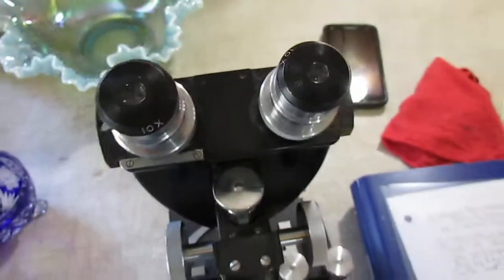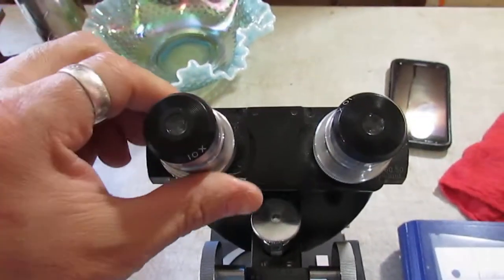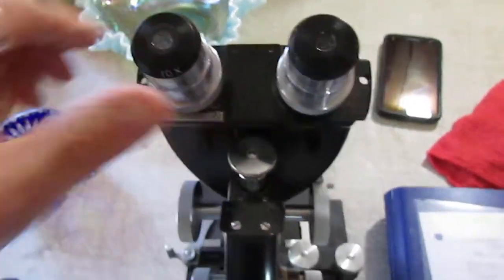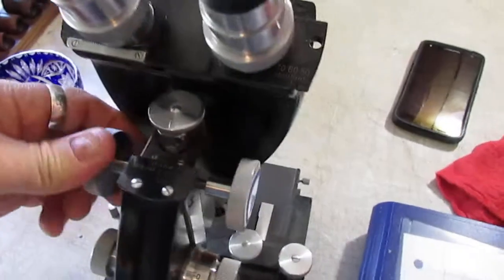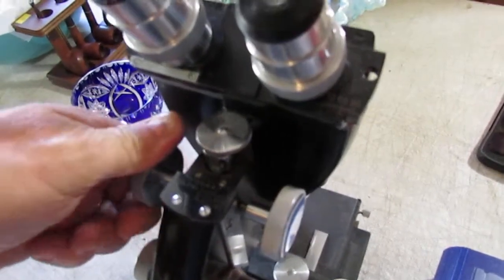But really in this video we just wanted to show that all the adjustments did work. You've got the eyepiece adjustment right there, the main elevation adjustment right there.